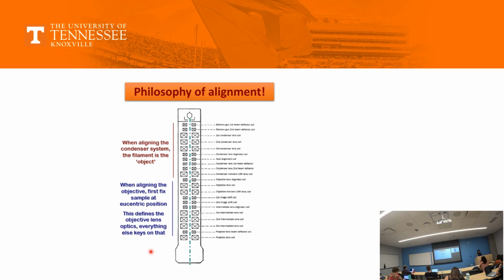The final remarks are again 3. You will go to an instructor, and he will tell you to align the condenser, align the objective, and then a little bit he will tell you about the projector system.